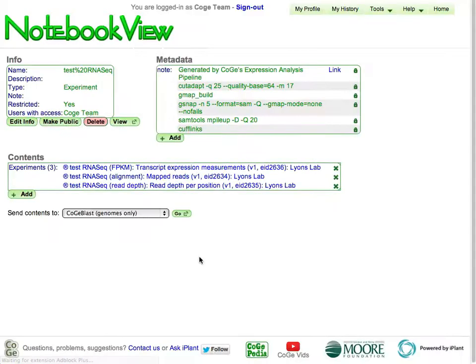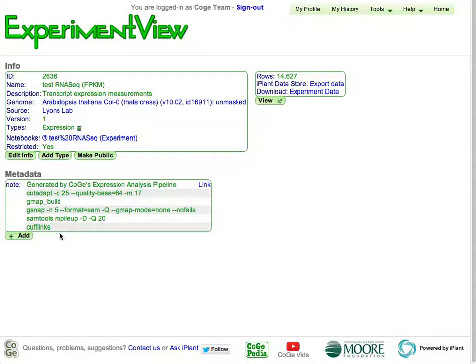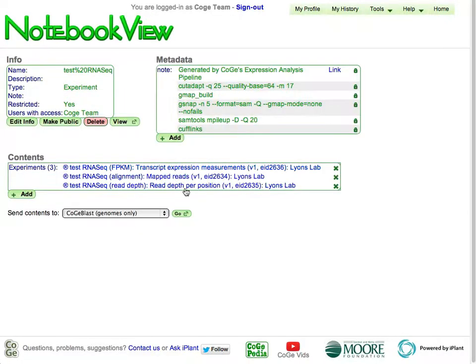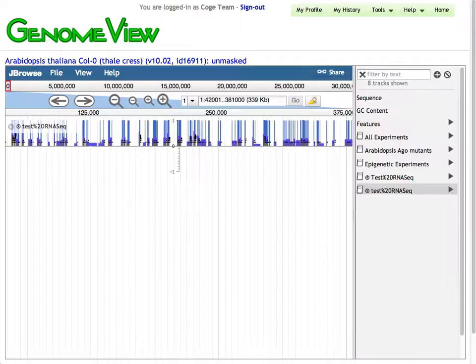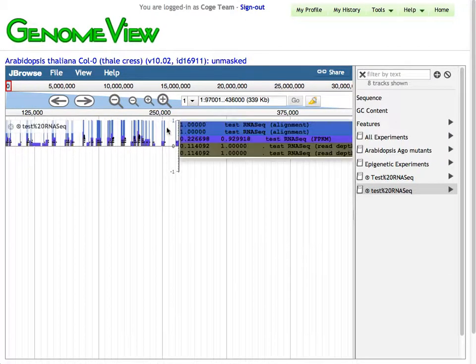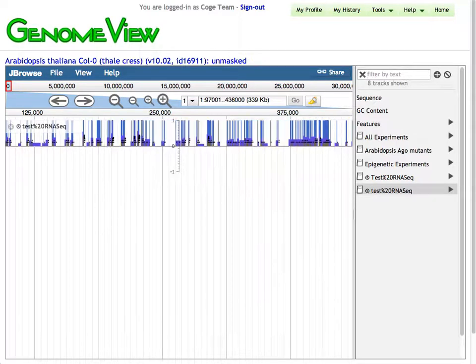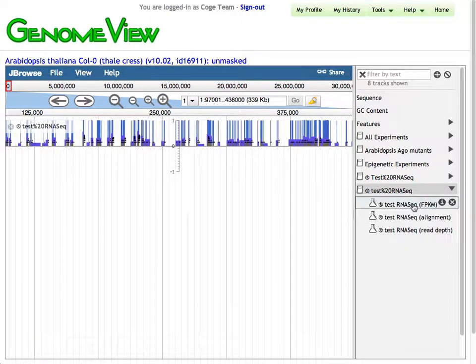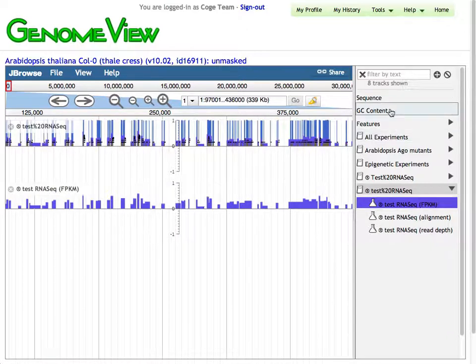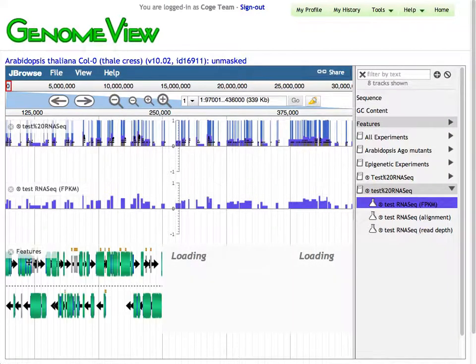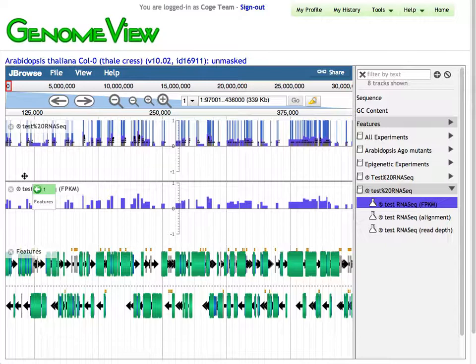We're going to go to Notebook View — all of these data have been added into one notebook. Here's our FPKM experiment. If I click on that, I can get details about that. This will include some metadata that we add about our pipeline. Importantly, what we can now do is take this and visualize this particular experiment. What we end up with is our genome browser based on JBrowse. Here's the notebook — these are all three experiments that have been tacked into it. So I can look at my FPKM data, and I'm going to go ahead and add in some gene features so we can see what those are mapping to specifically, and move those features right above the FPKM values.